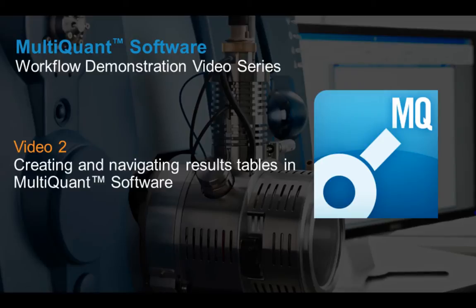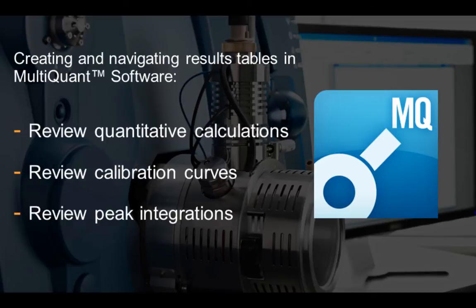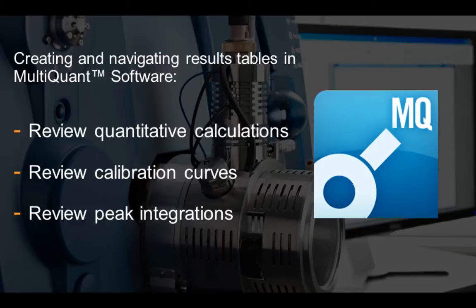Creating and navigating results tables in MultiQuant software is very easy and gives you dynamic power to review the quantitative calculations, calibration curves, and chromatographic peak integration easily and efficiently. This video will show you how.